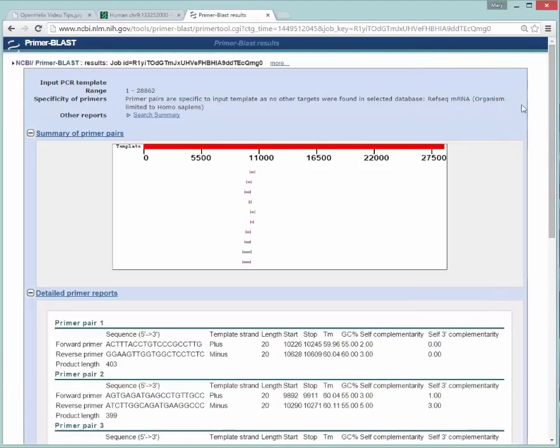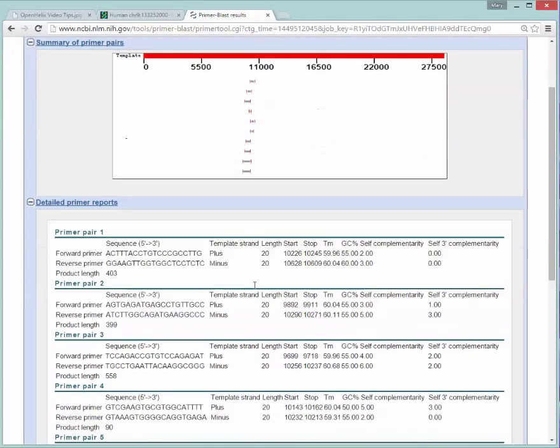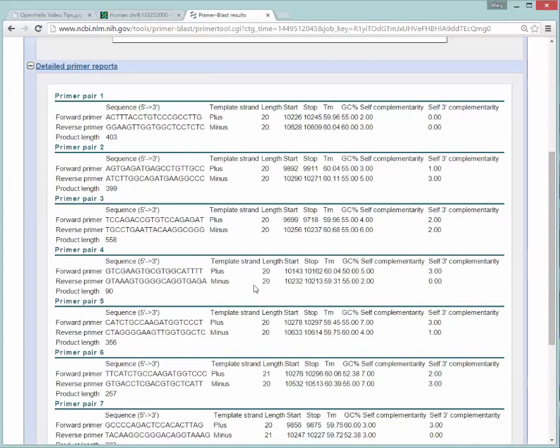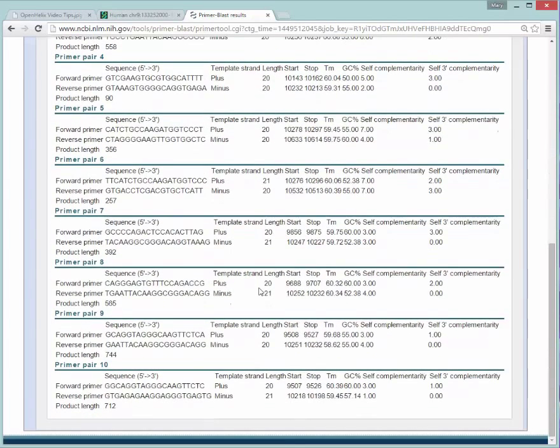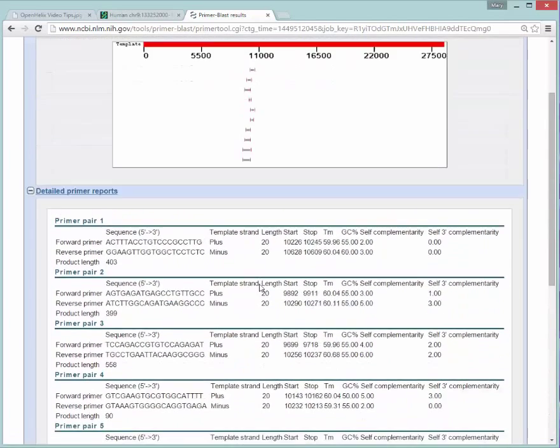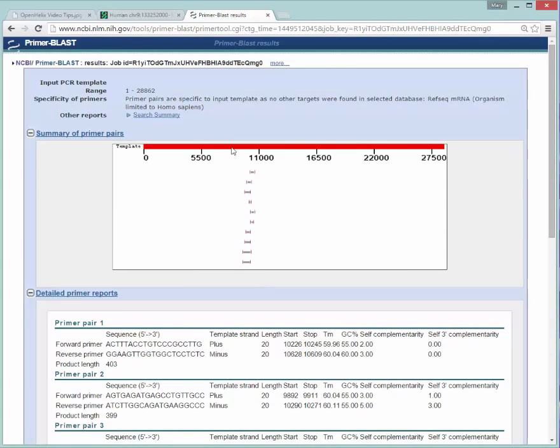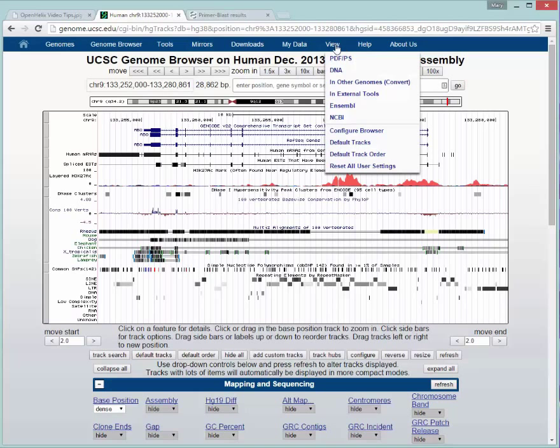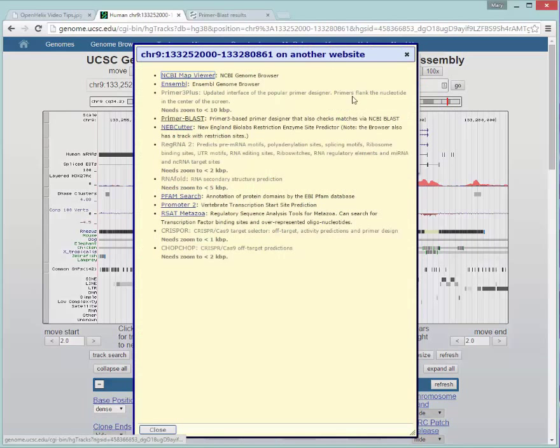So here we are with the results from Primer Blast to choose primers that might be suitable for your sequence that was provided. Here we can see them all listed. So that gives you one example of the types of things you can do from the View in External Tools menu options here.